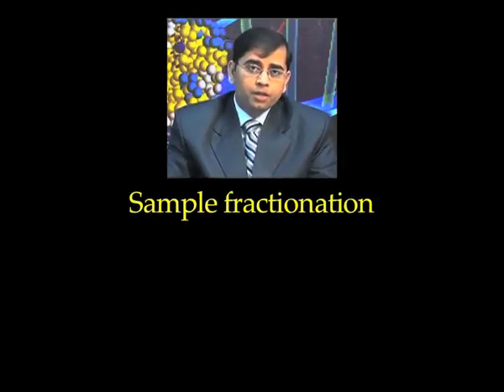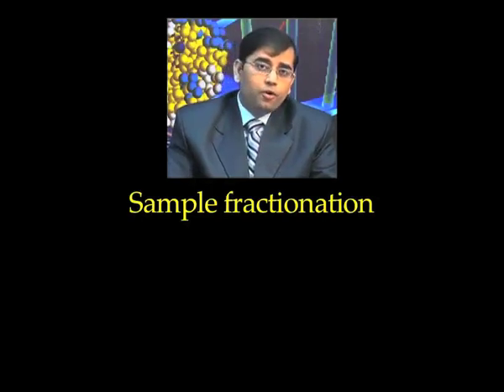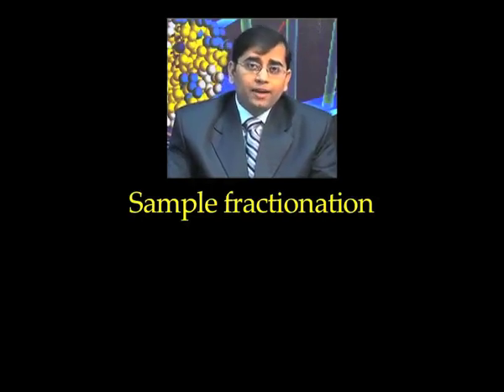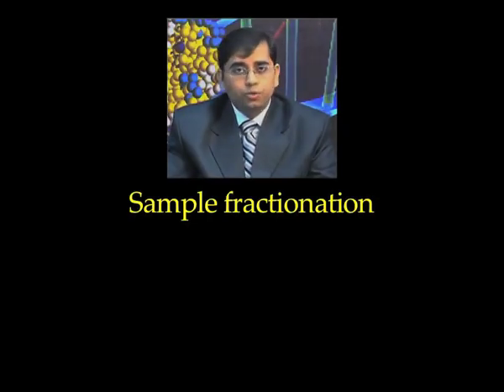For example, if you are doing a proteome analysis of a particular organelle, then you need to fractionate your sample. Or if you are looking for wide proteome coverage, but the proteome poses a challenge in separating the whole protein mixture simultaneously, then one needs to do fractionation to reduce the complexity of the sample.